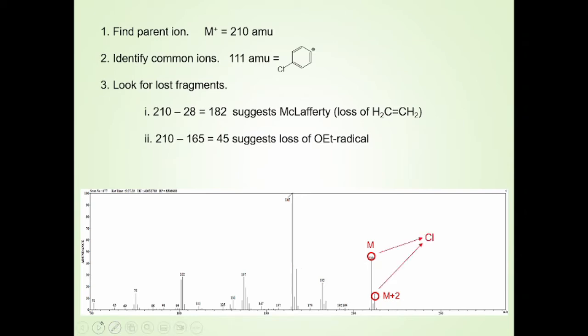It's important to remember when you're dealing with mass spectrometry that what's going into the mass spectrometer are single molecules. And a single molecule will have either a chlorine that has a mass of 35 or a mass of 37. The masses we see on the periodic table are average masses. So chlorine, 75% of chlorine atoms are chlorine 35 and 25% are chlorine 37.